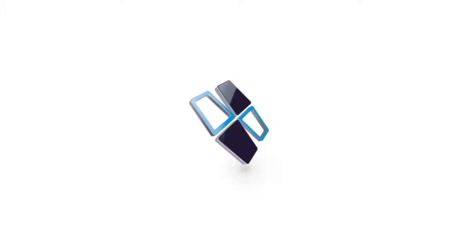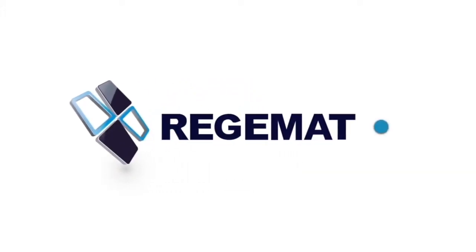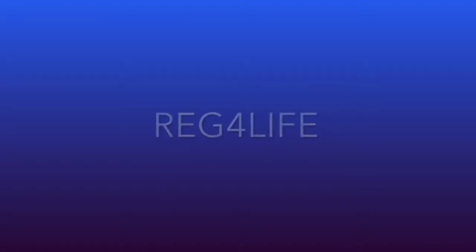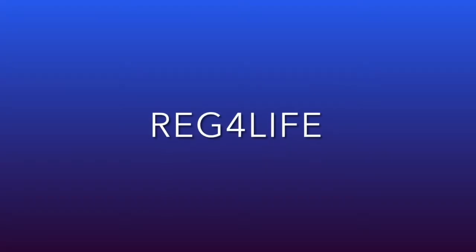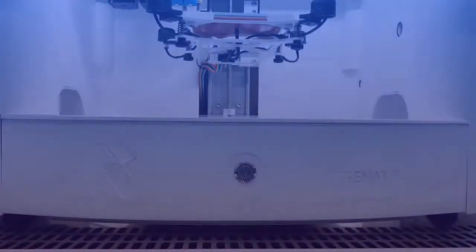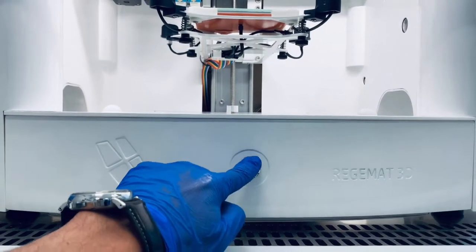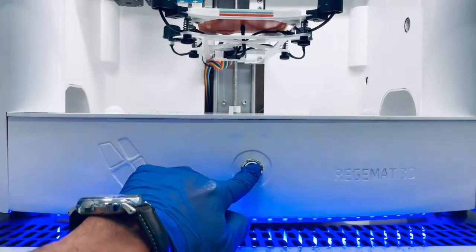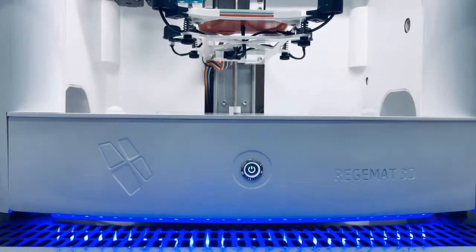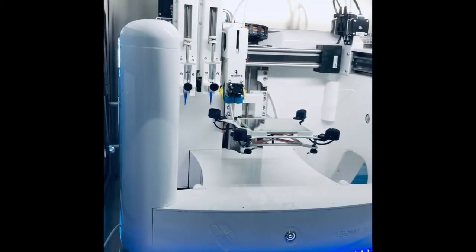Alright, bioprinting colleagues, let me present you our new star product, the Reg4Life. In this version we have maintained the robustness and modularity of our previous model, the BioV1, and we have included several upgrades and new developments as well.